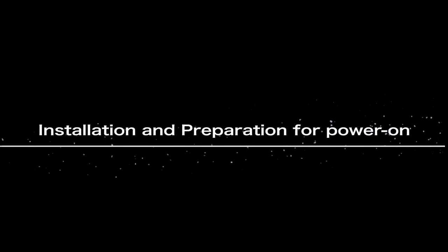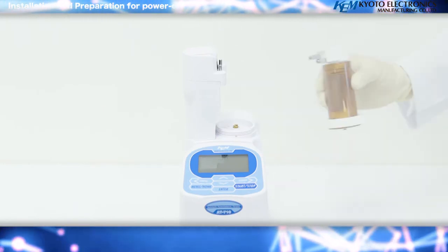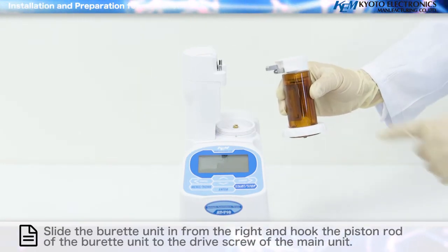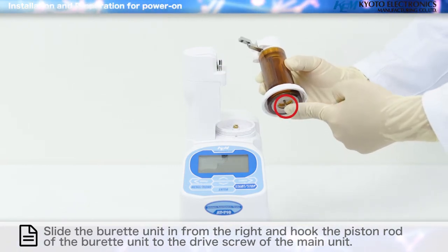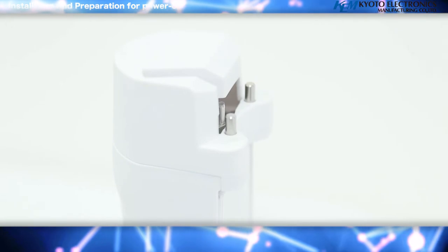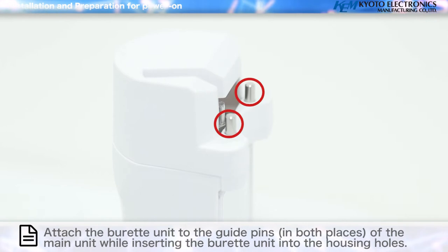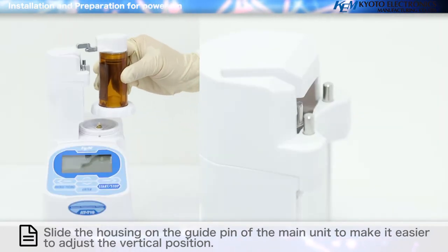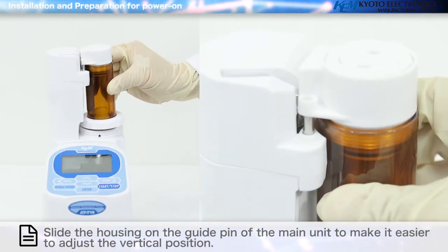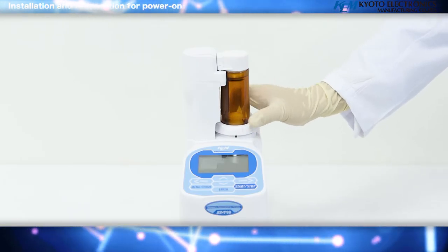Installation and preparation for power on: Slide the burette unit in from the right and hook the piston rod of the burette unit to the drive screw of the main unit. Attach the burette unit to the guide pins in both places of the main unit while inserting the burette unit into the housing holes. Slide the housing on the guide pin to adjust the vertical position. Tighten the burette stopper and secure the burette unit.